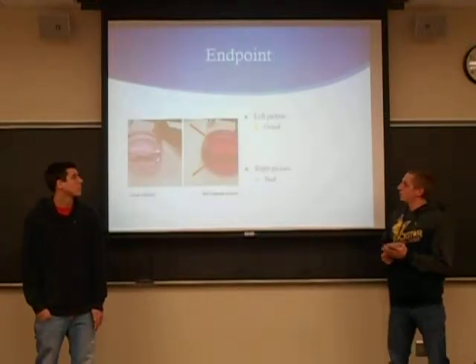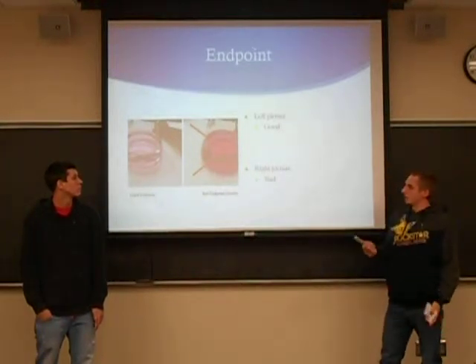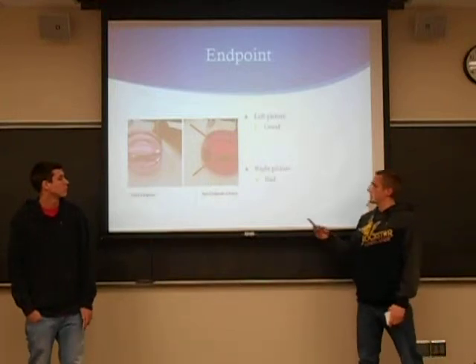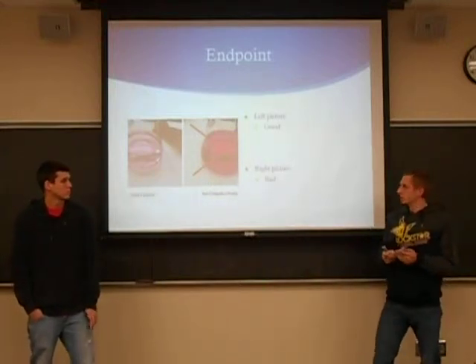And for the endpoint, the lighter color is a good endpoint because it means you reached neutralization, and the bad endpoint is dark pink because you added too much of the strong base to the solution.